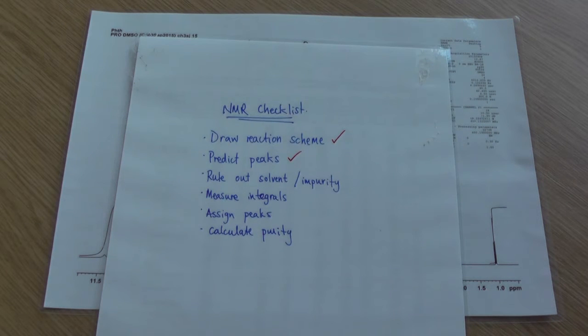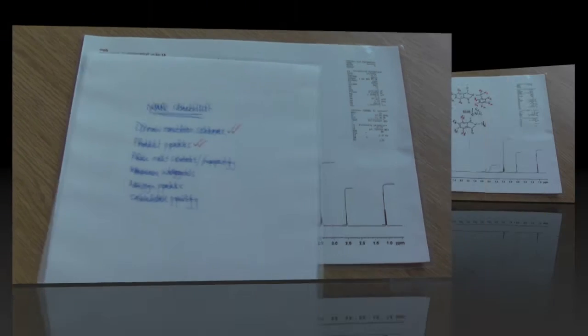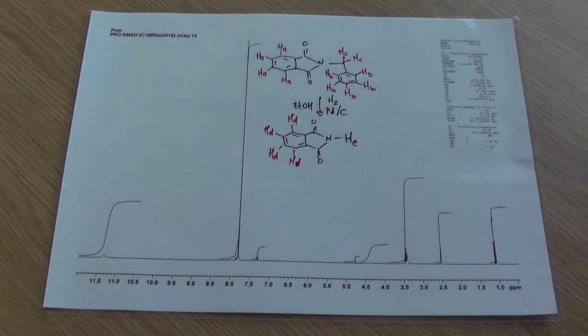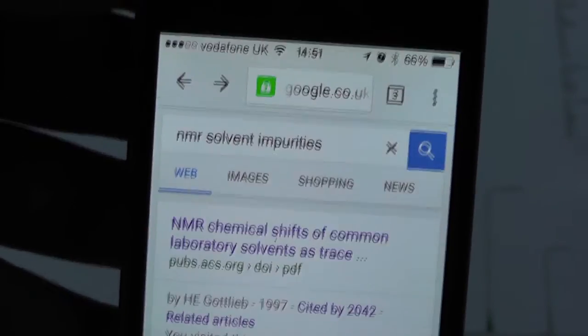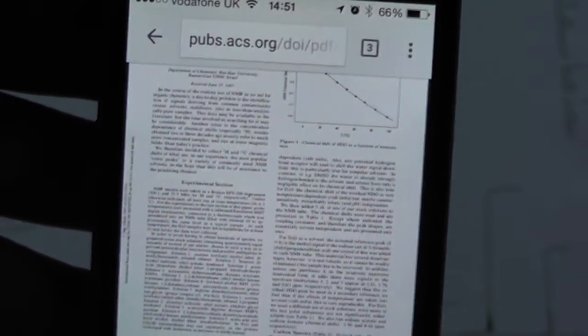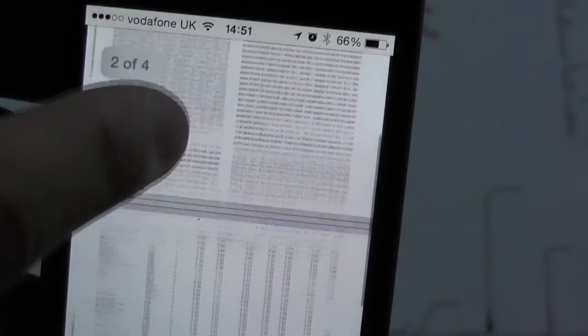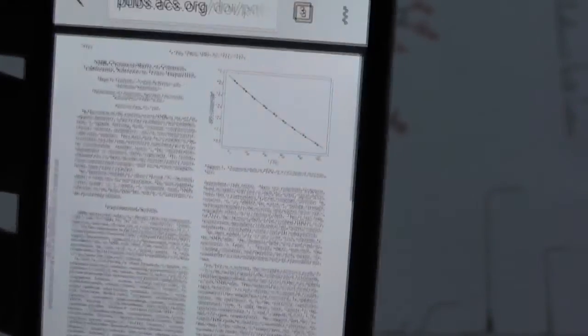There's a big table full of common solvent impurity peaks that might be present in an NMR spectrum. All you need to do to get to it is google NMR solvent impurities and click on the first link. That will take you to a big PDF with a big table full of numbers. To make things a little bit easier we've printed it out.